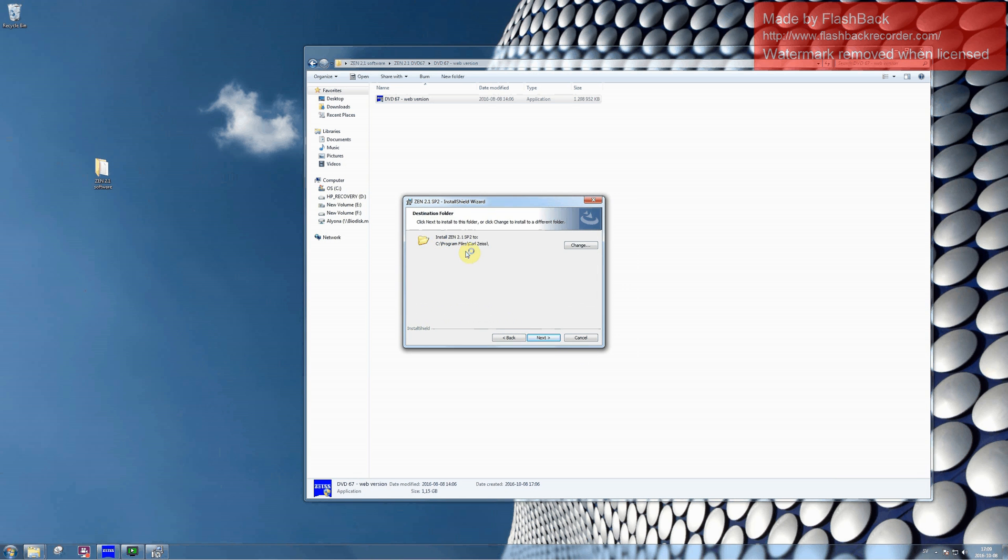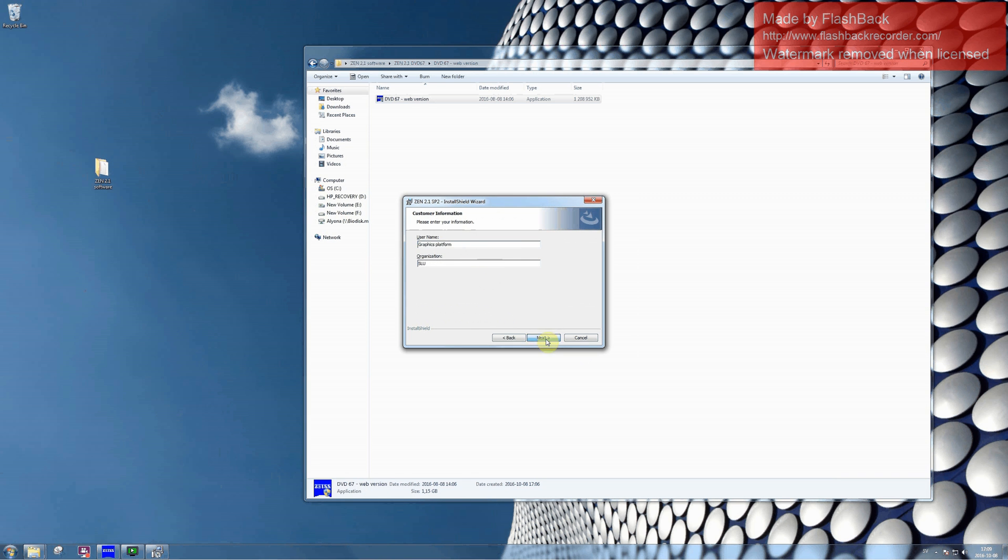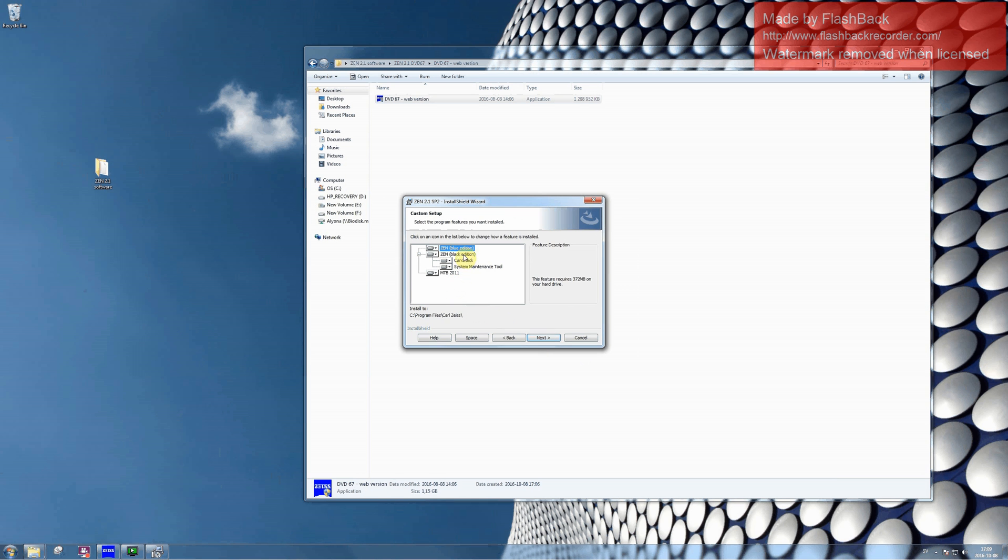Allow the software to install the program on your disk C. Type in any username you want and click on Next. Please install all the components offered by the installation program.